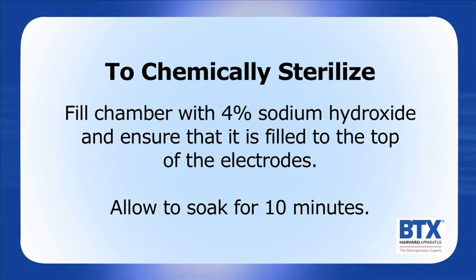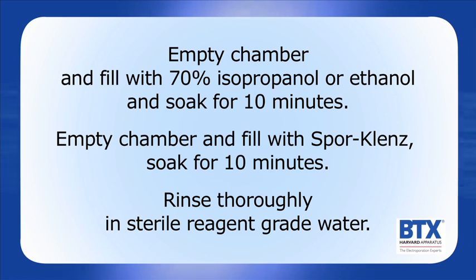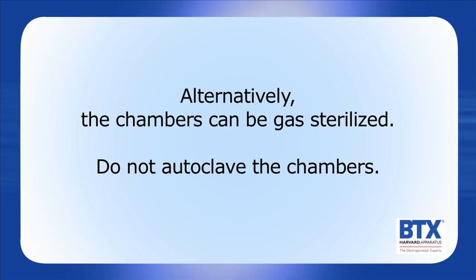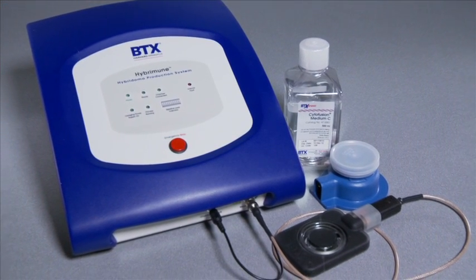To chemically sterilize, fill the chamber with 4% sodium hydroxide and ensure that it is filled to the top of the electrodes; allow to soak for 10 minutes. Empty the chamber and fill with 70% isopropanol or ethanol and soak for 10 minutes. Empty the chamber and fill with Spor-Klenz; soak for 10 minutes. Rinse thoroughly in sterile reagent-grade water. Alternatively, the chambers can be gas-sterilized. Do not autoclave the chambers. This concludes the setup and video training for the Hybrimune system.